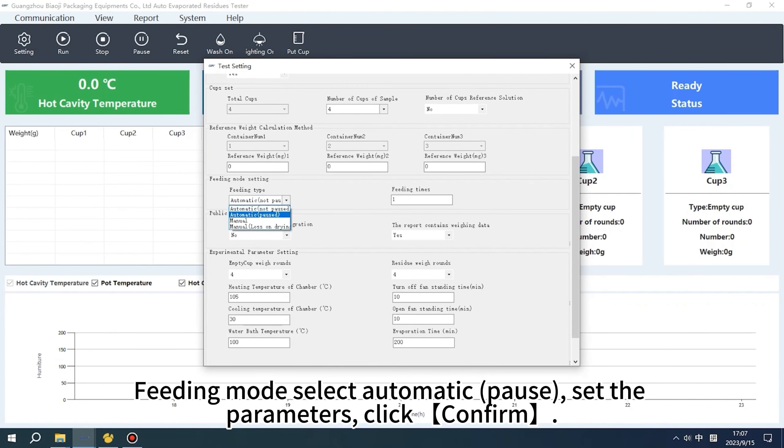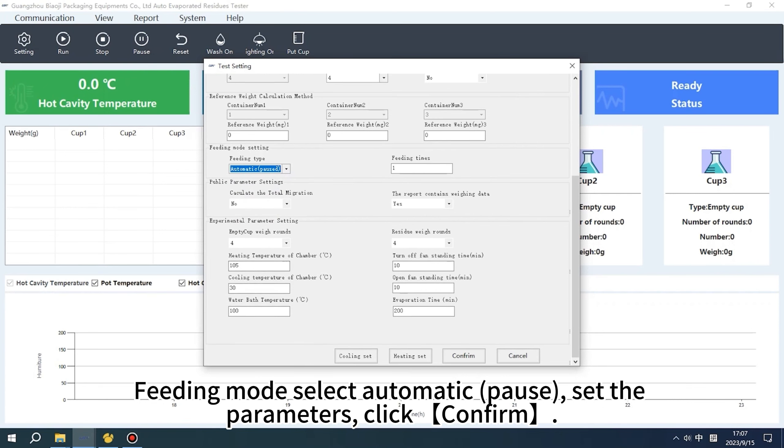Feeding mode: select automatic pause. Set the parameters, click confirm.